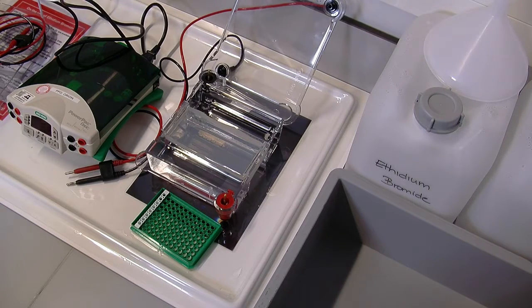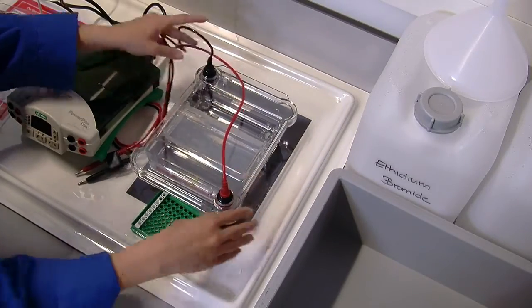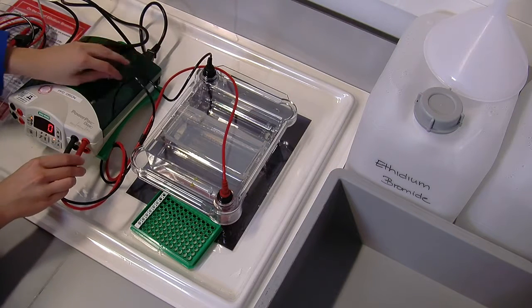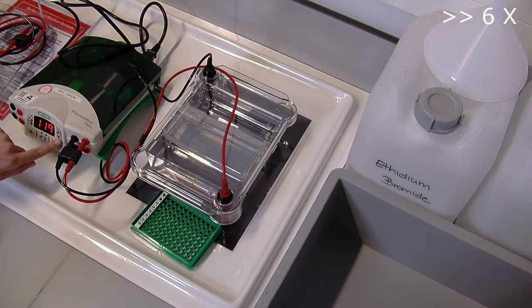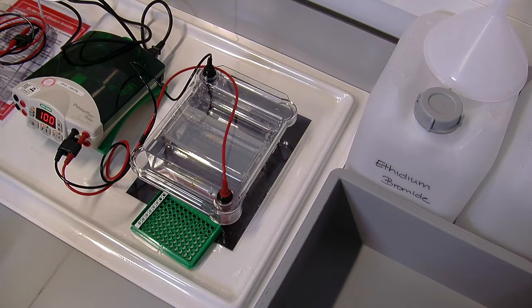Close the lid. Make sure the negative charge is above the slot. Switch on the power supply. Set to the appropriate voltage. This is 100 volt. Press start if necessary. And check if bubbles rise from both electrodes.